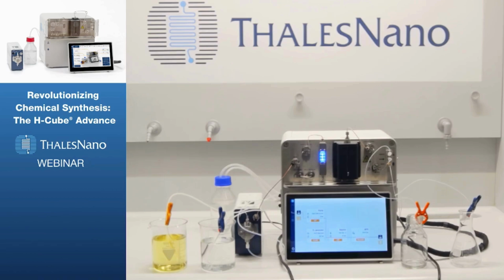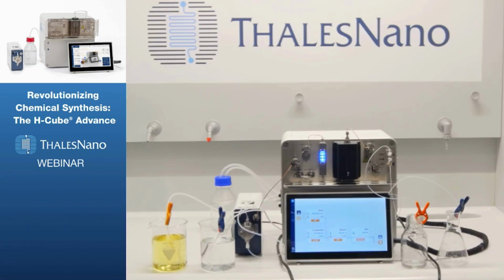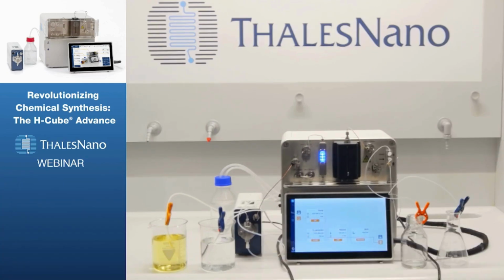But before you do that, I always advise that we do a post-washing cycle as well. So we just clear out all the materials that we injected into the system. And in order to do that, we can just very simply switch back to the waste collection flask. And now you can see we are collecting the material to the waste flask now. And I'm also going to switch from the starting solution to the clean solvent also on the inlet side. And now we have basically initiated the washing.